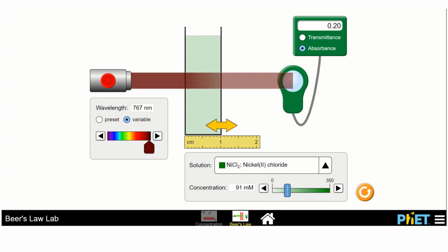Now I believe in you, and I know you can get through everything else and complete this experiment. At least part 1. We'll talk about part 2 right now. So you're going to go through, collect the data that you need, take it step by step. Don't rush ahead or anything. Complete one step at a time.